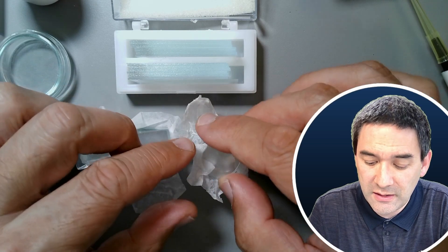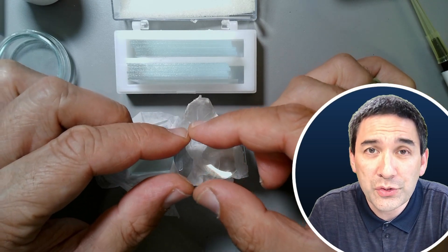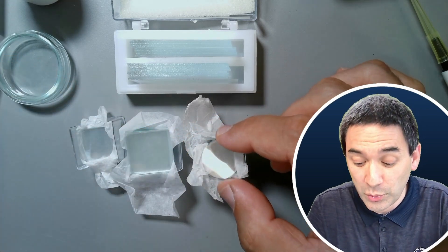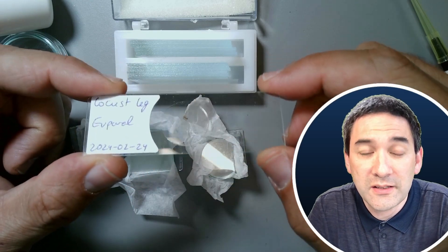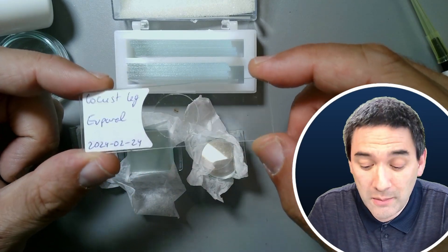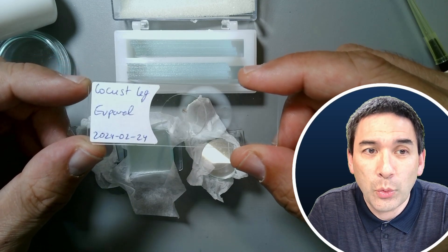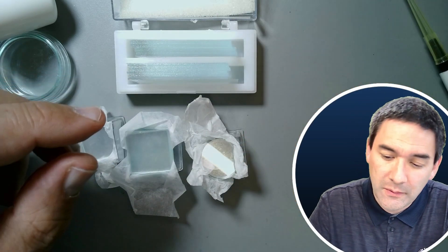But look at this one. This one is round. They are significantly more expensive. Those round cover glasses are used primarily if you want to make permanently mounted slides. I'll show you an example here. It has a round cover glass and it simply looks nicer, but the square ones also work perfectly fine. This is a locust leg, not egg, leg. Insect leg.